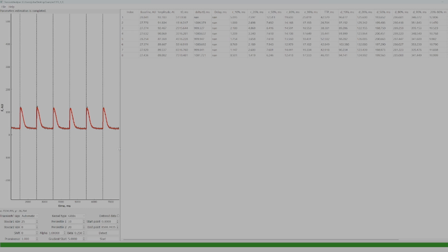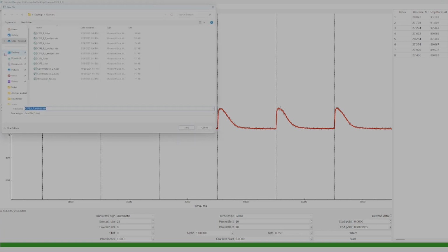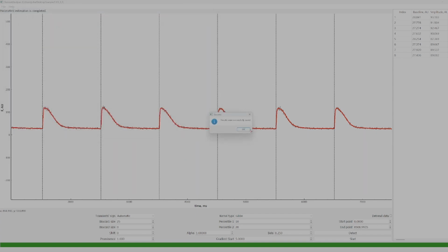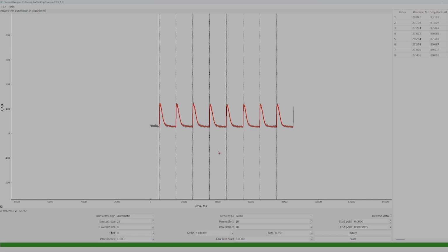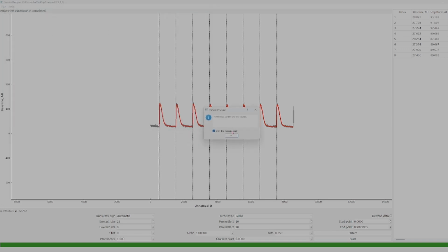When you are finished and if you are satisfied with your data, with your analysis, you just can save results or again press Ctrl+S. Yeah, in this case, you just go to the folder where you opened your file. You cannot open this analysis file again. In this case, it will show you that a file must contain only the columns.